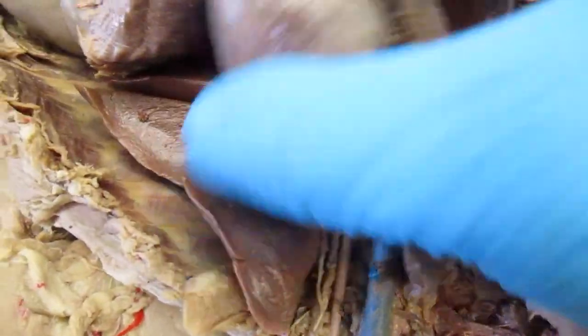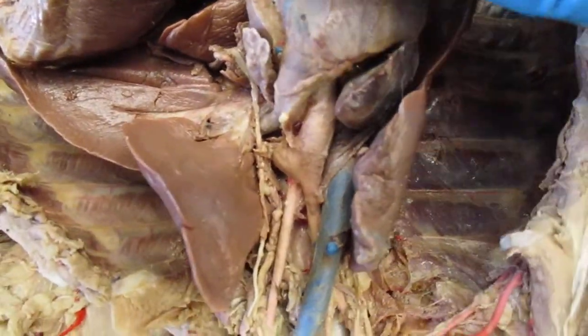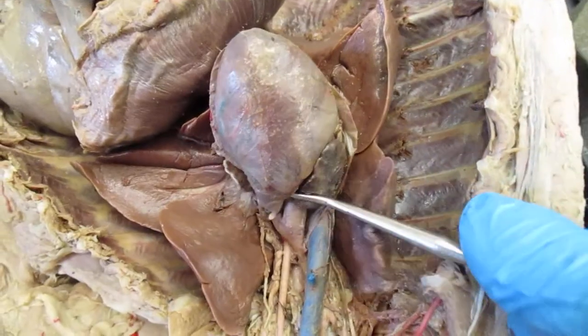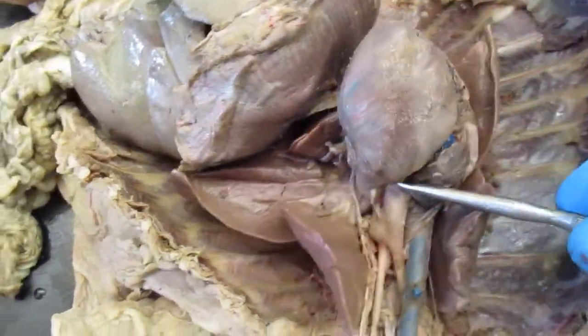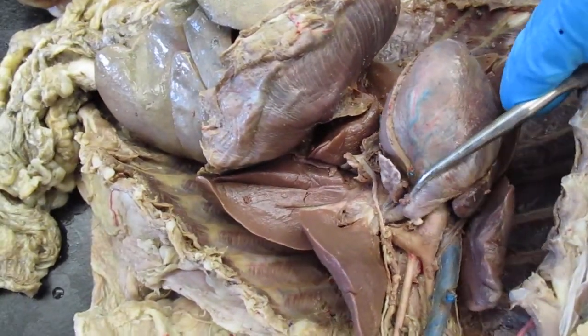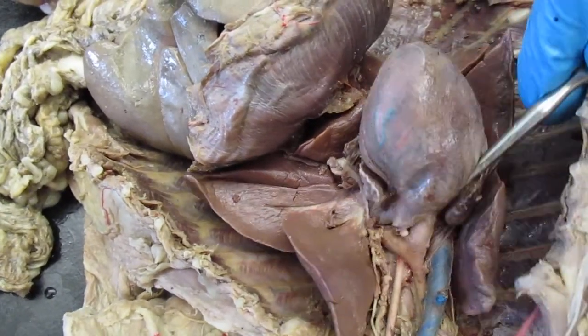And then right here you can see the pulmonary trunk right here. So here's your pulmonary trunk, right? Let me stick my probe through there. So here's your pulmonary trunk, and this structure here is the pulmonary artery.